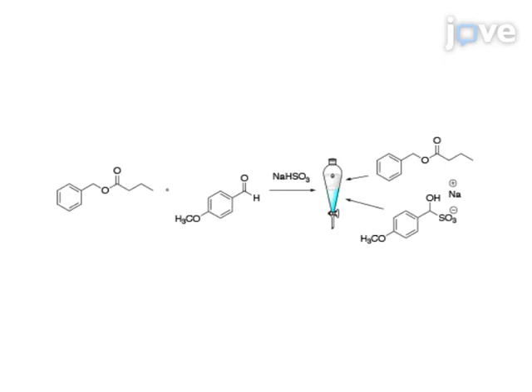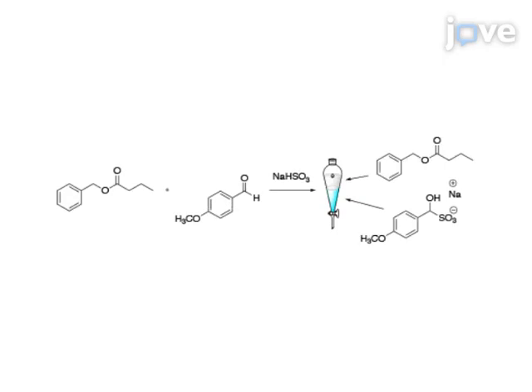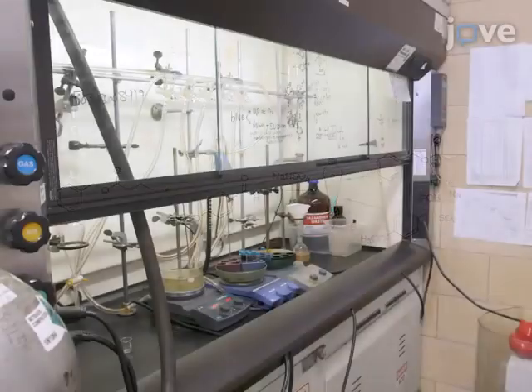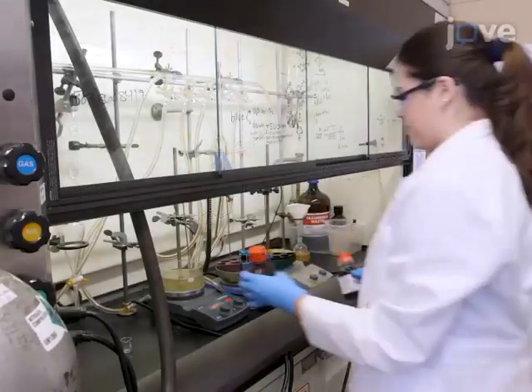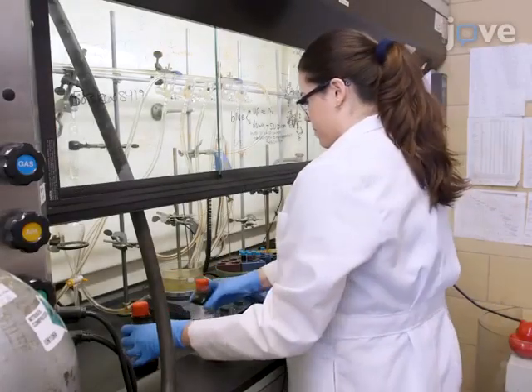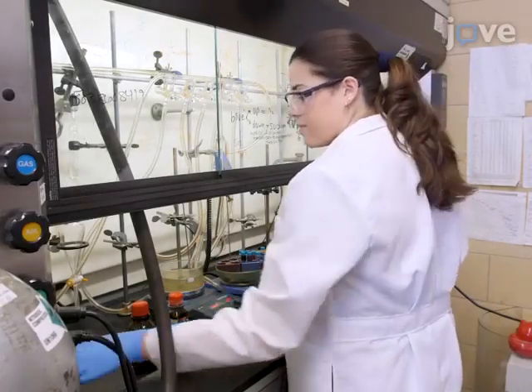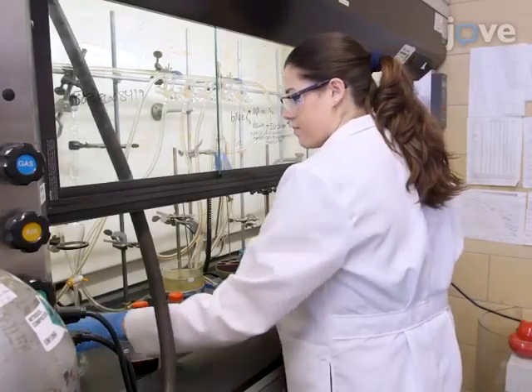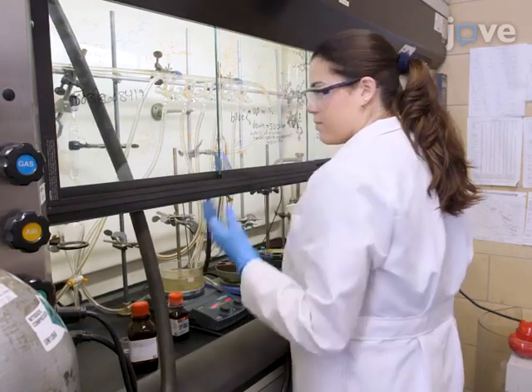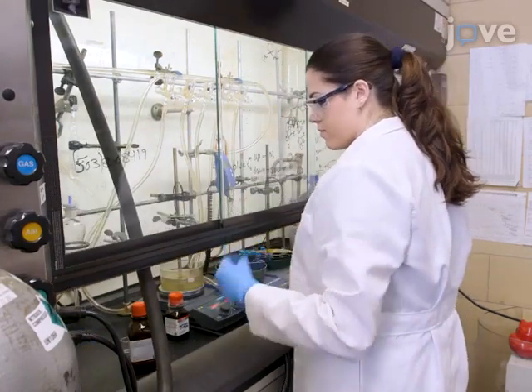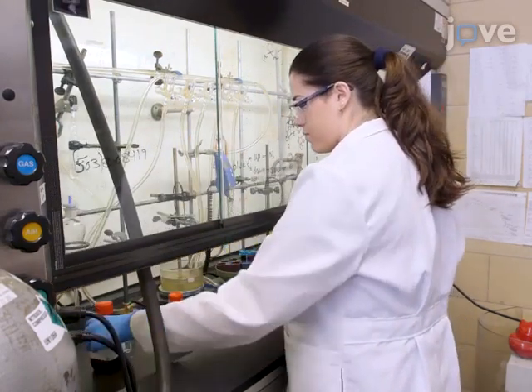The separation of aromatic aldehydes from a mixture is demonstrated here for the separation of benzylbutyrate from a 1-to-1 mixture with anisaldehyde. Throughout this procedure, sodium bisulfite can generate sulfur dioxide gas. Thus, this protocol should be carried out with proper ventilation, such as in a fume hood.